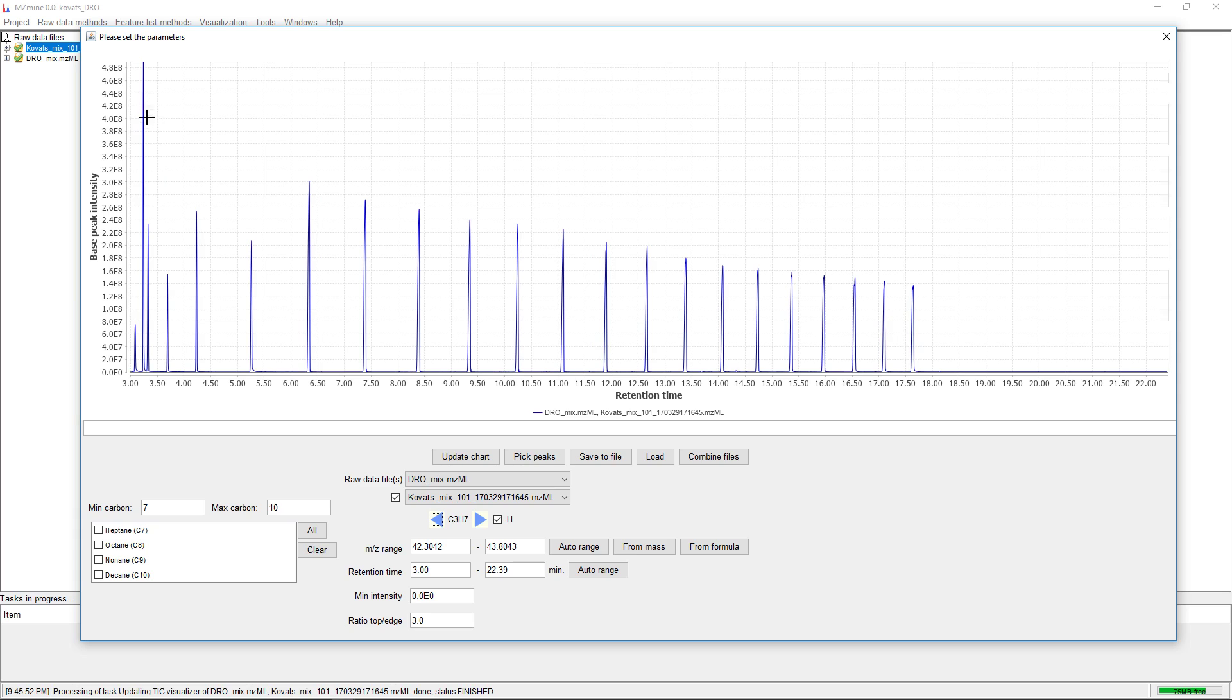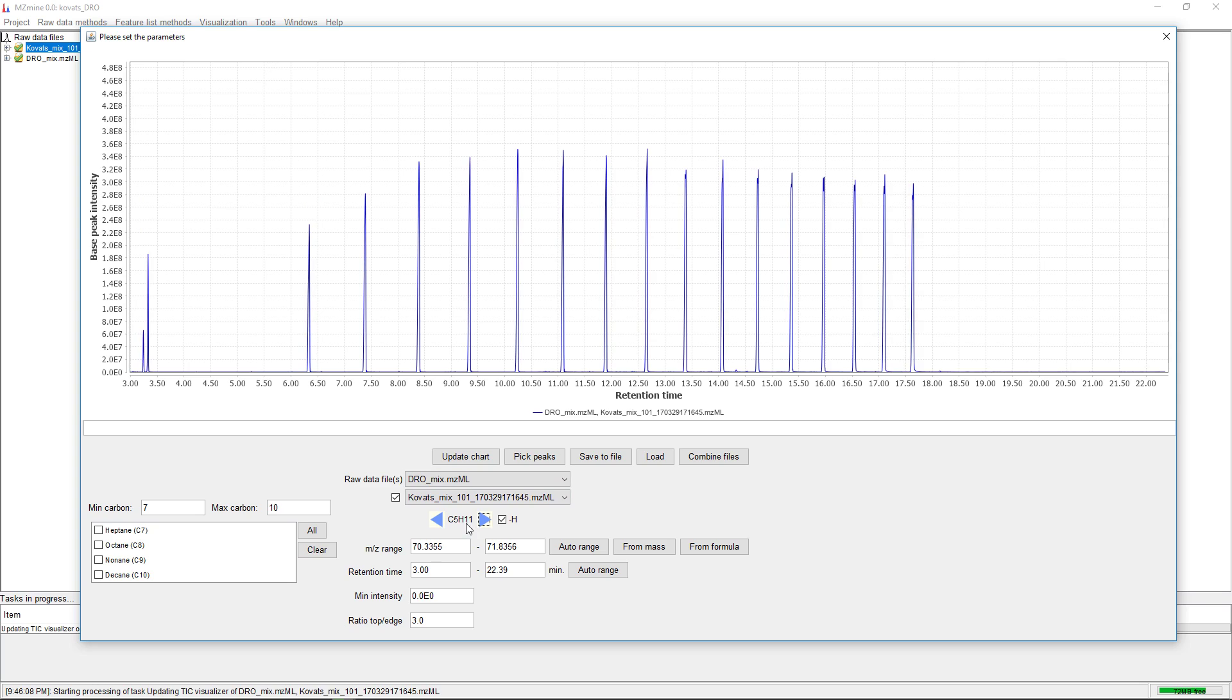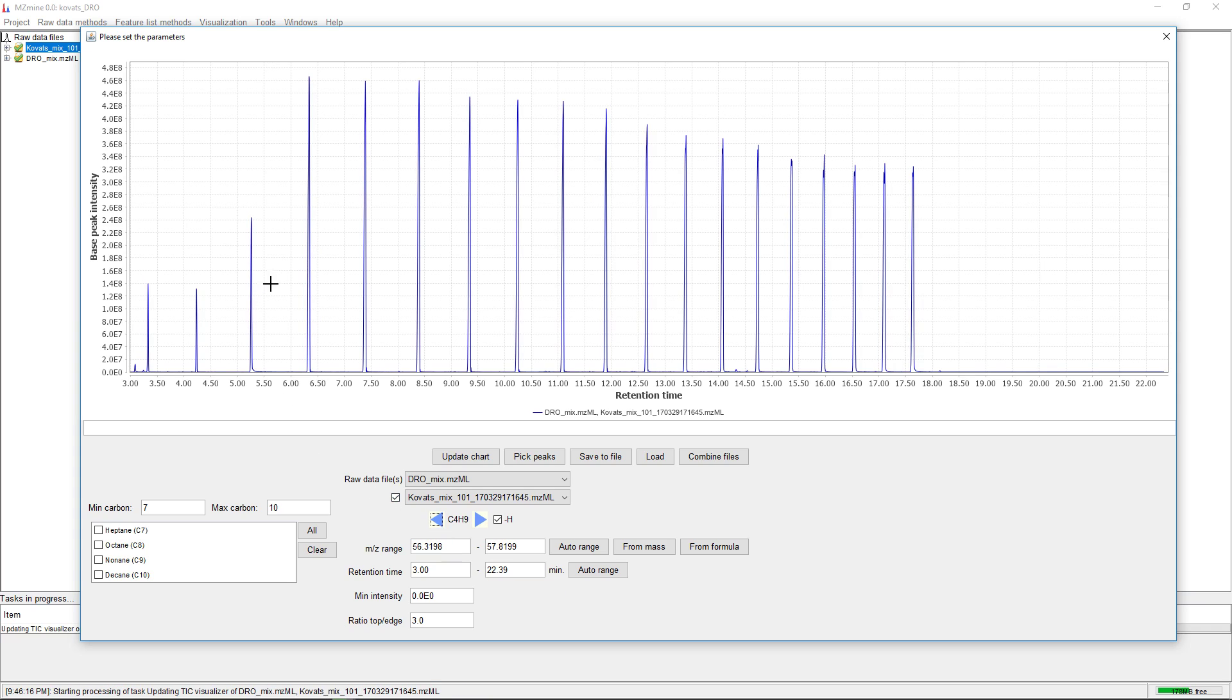We don't want to capture these. It's better to go higher to something like C5, but these are already small, or C4, and this one seems to be good.